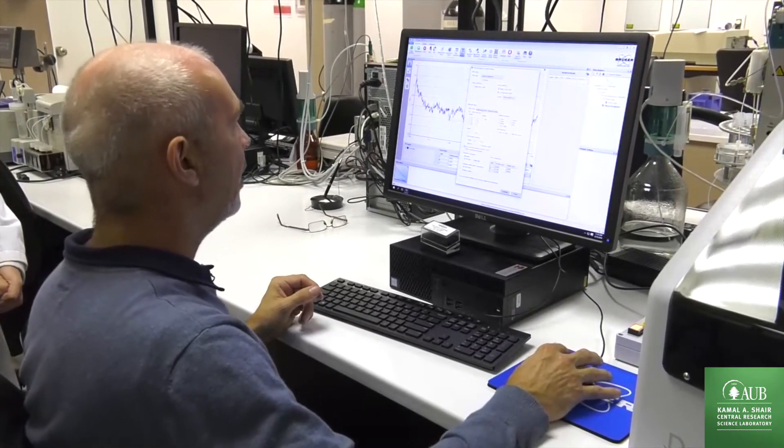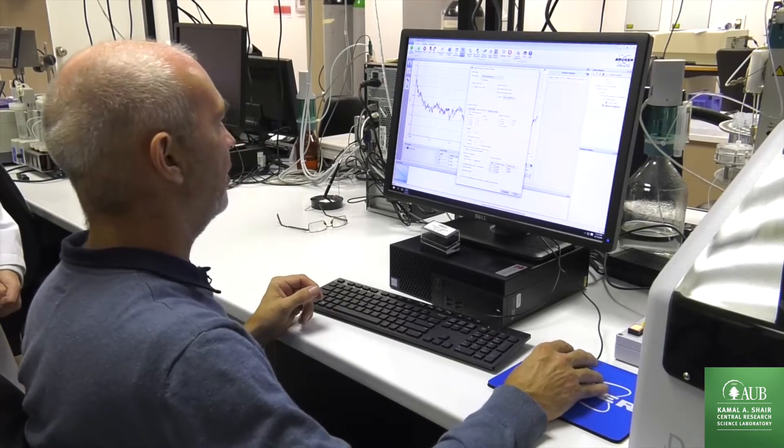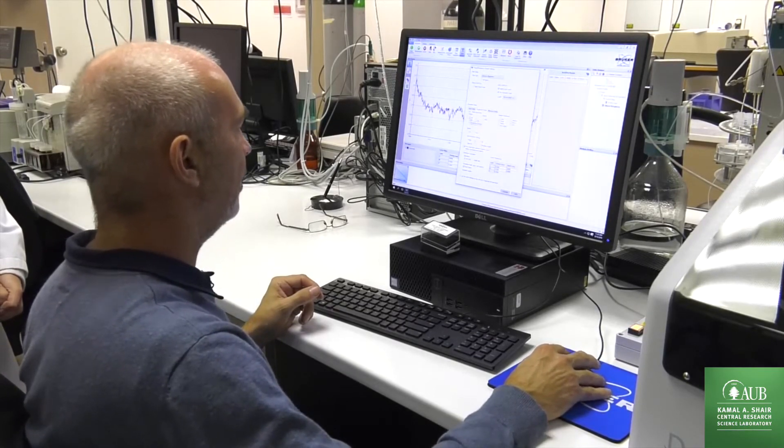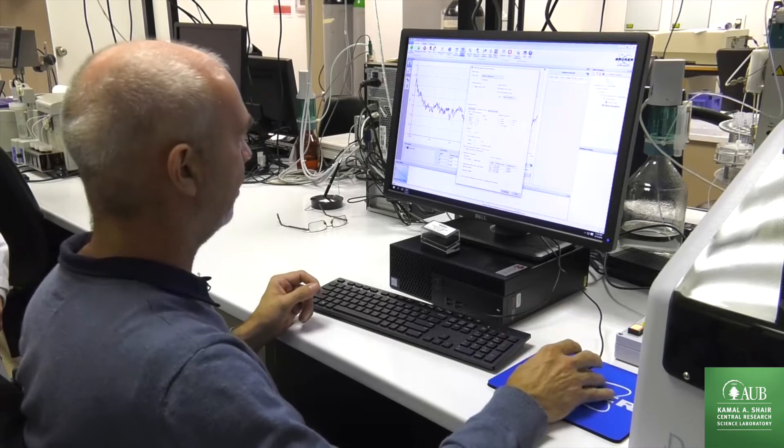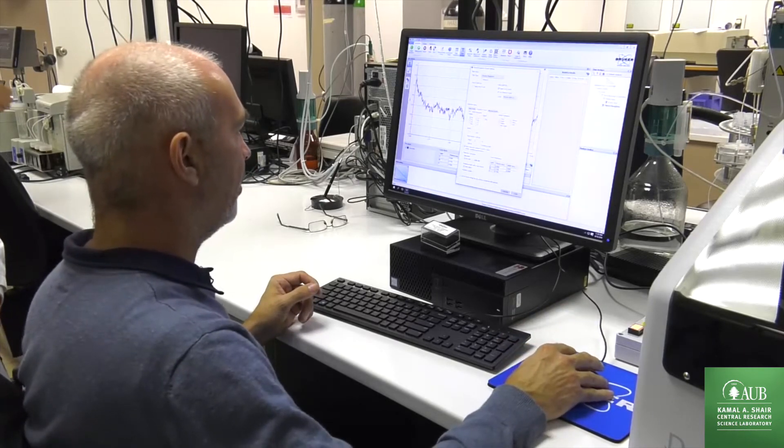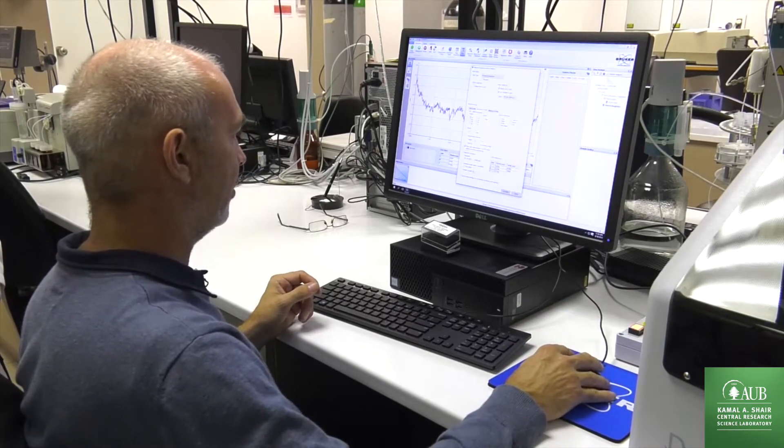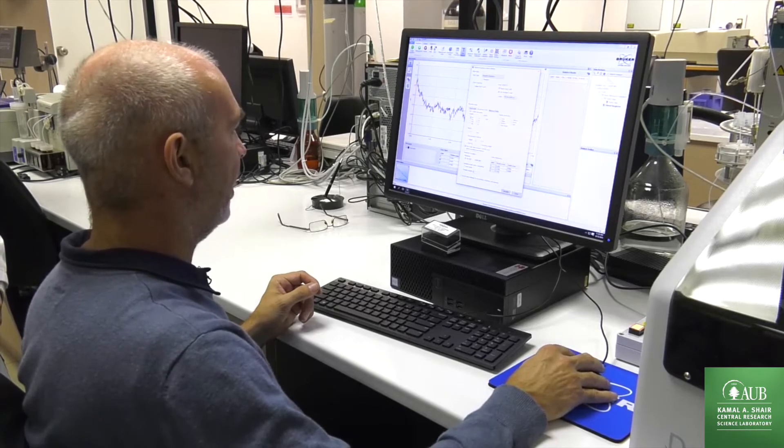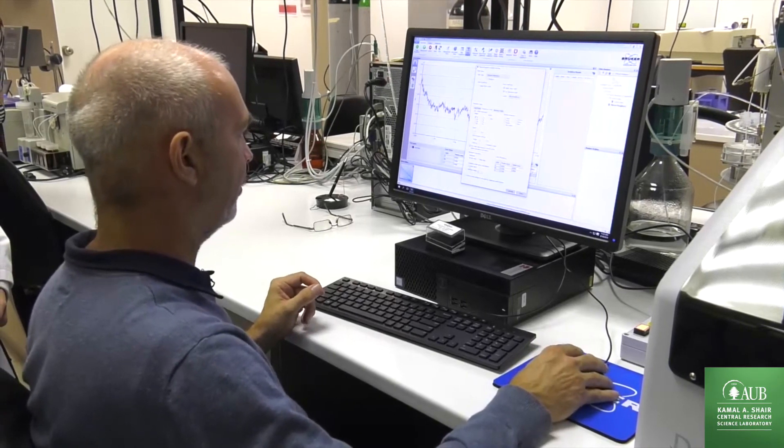I go to roughness profile and select what kind of roughness I want to measure, RA. And I make sure that we have our number of sampling lengths set to 5, but turn off auto-select.